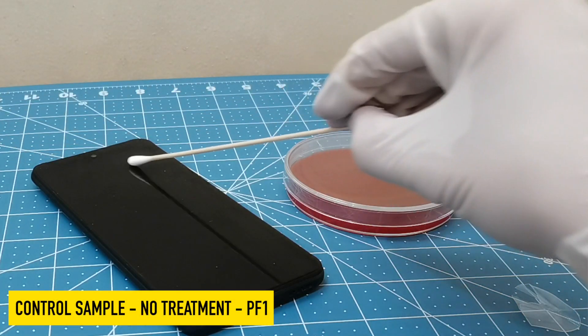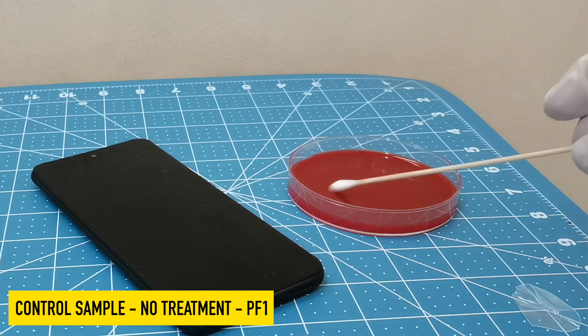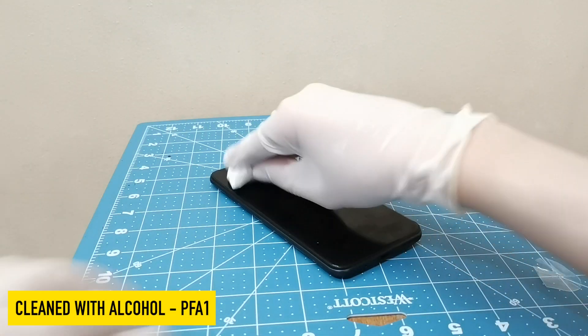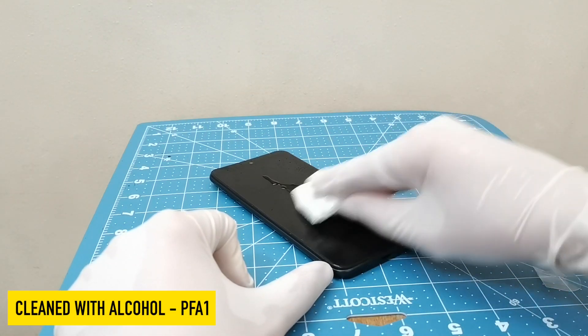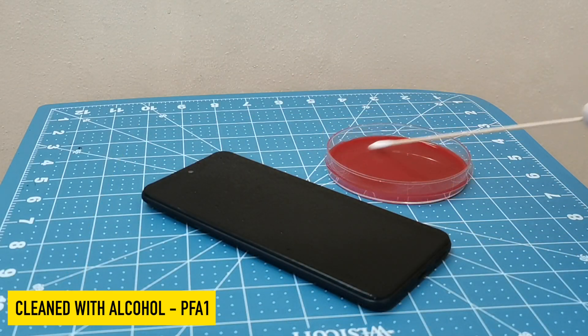So today we're going to find out with the help of some Petri dishes. The first thing we'll do is take a control sample. We'll swab the front of our cell phone and apply that to the Petri dish. Next, we're going to clean the phone using alcohol and we'll make sure it's completely dry before we swab it again and apply that to another Petri dish.